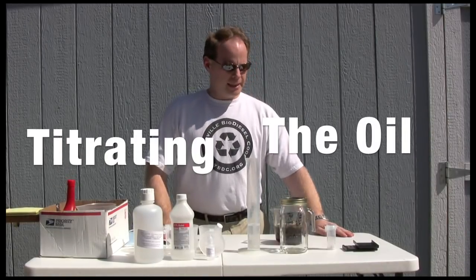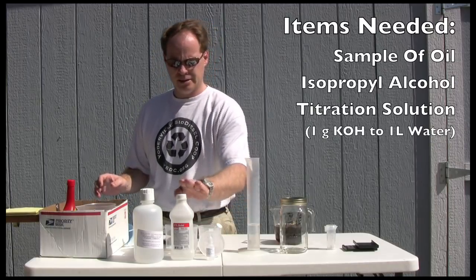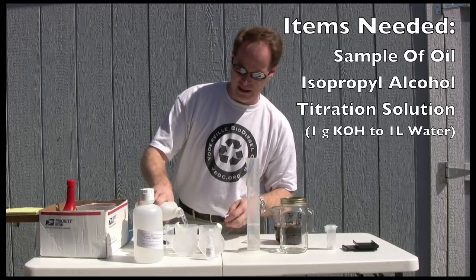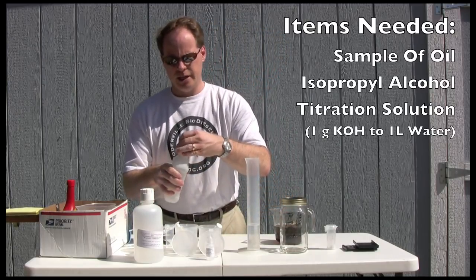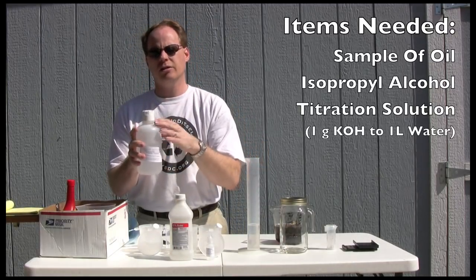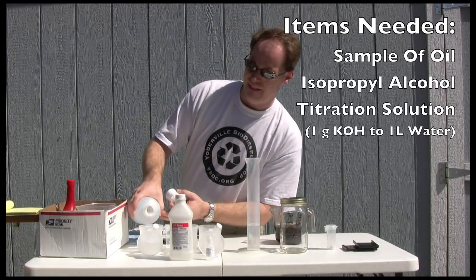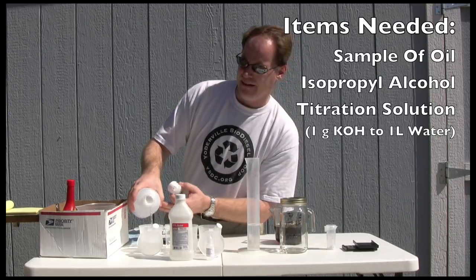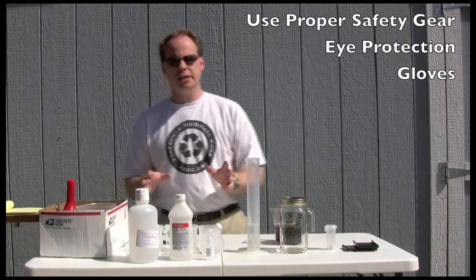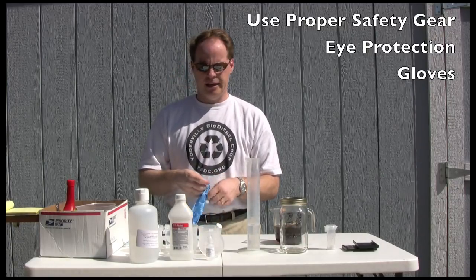First thing we need to do today is titrate our oil. How we do this is very simple. We are going to measure out some oil and some isopropyl alcohol in a cup, put a little bit of that in there, and I have some titration solution pre-put together. It was one gram of potassium hydroxide to one liter of water, all mixed up and ready. Before we titrate, it's important to wear some safety gear — safety gloves and glasses.